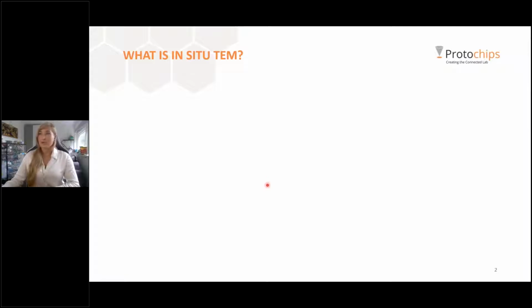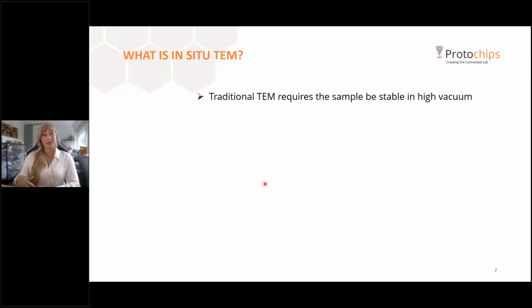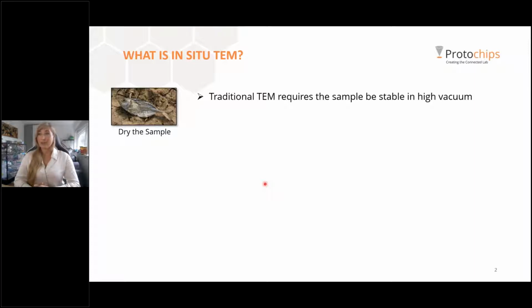So let's start off with what is in situ TEM. For those of you who haven't worked with in situ TEM before and have worked maybe with traditional electron microscopes, you might already know that a traditional electron microscope requires your sample to be in vacuum. To do that, most people actually dry their sample on a TEM grid, which is usually made out of copper and carbon, could also be gold or titania. But the problem with this is that any sample that is usually studied in operando mode doesn't typically operate in a vacuum. They operate under a liquid with maybe electrochemistry or heating, or maybe with gas and heating or other heating, electrical currents.